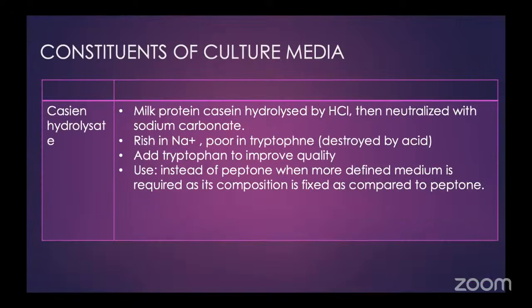How much amount do you require per petri dish, which is 90 mm? Somebody please put it in the chat box. For a 90 mm plate, how much agar media do you require to produce a media which is 4 to 5 millimeters thick?